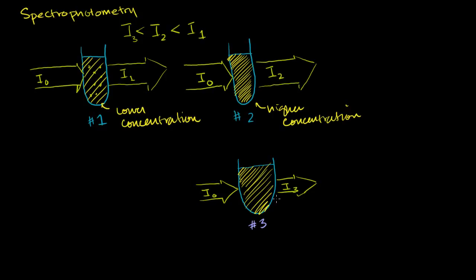And if you were looking at these, this has the least light. This has a little bit more light being transmitted. This has the most light being transmitted. So if you were to look at this, if you placed your eyeball right here, those are your eyelashes. This one right here would have the lightest color. You're getting the most light into your eye. This would be a slightly darker color, and this would be the darkest color.